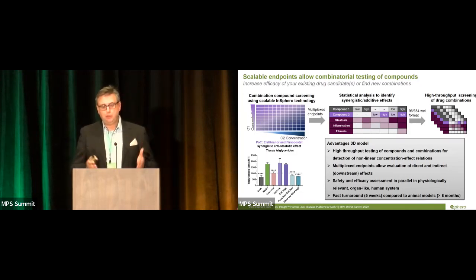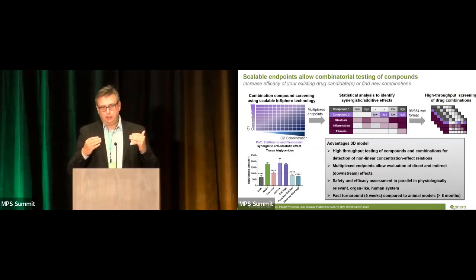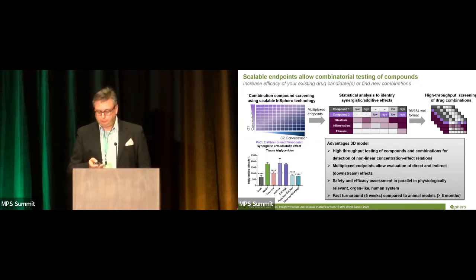So to be able to do that, we need a high-throughput compatible solution. We need to be able to measure the hallmarks of NASH in a highly integrated, low-cost biochemical assay setting, but we also need to be able to verify our findings in clinically relevant readouts. And all of these aspects we can fulfill with a fairly simple and easy to scale up spheroid system.